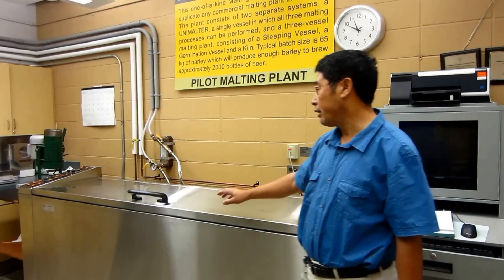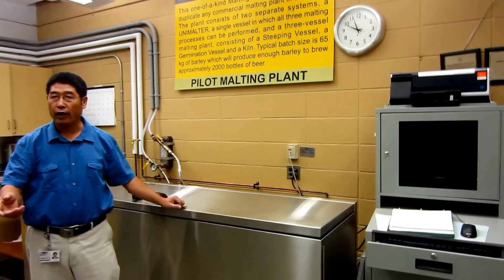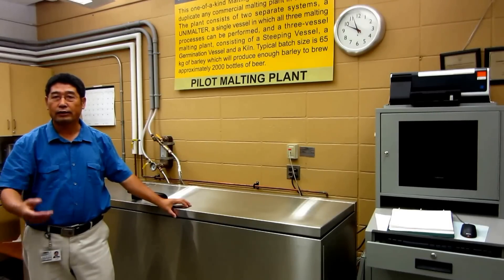This facility is mainly used for evaluating new barley varieties, because you can put a barley sample under the same processing condition, which gives you a better assessment.